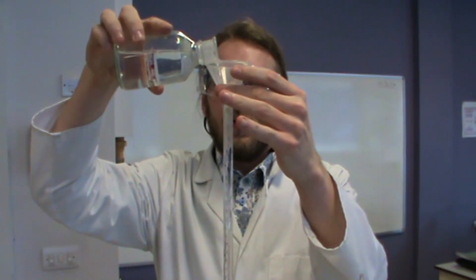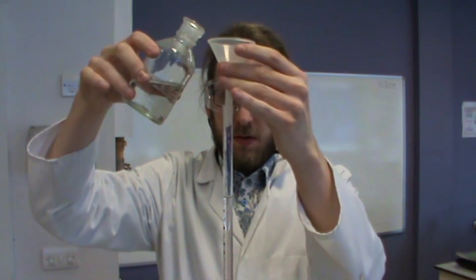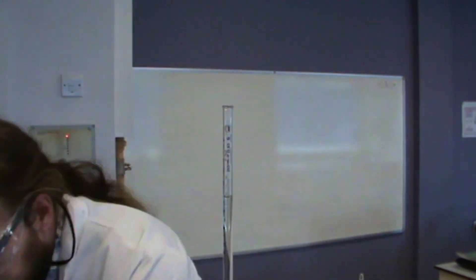To do this, a filter funnel is placed into the top of a burette no higher than eye level, and the burette is then filled with hydrochloric acid.